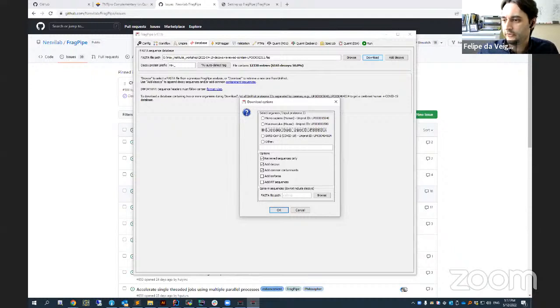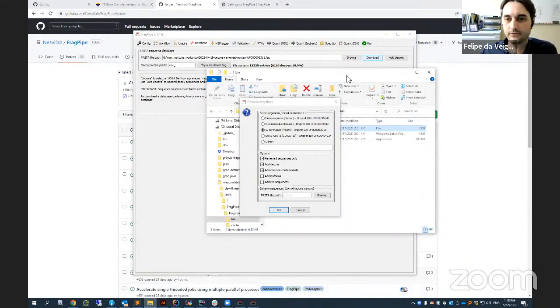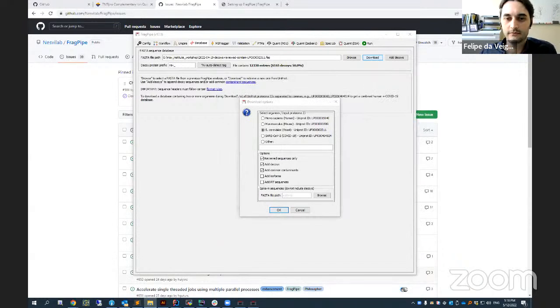FragPipe only shows TMT 16. Does it support 18? Yes, I think this version that we are showing right now doesn't have TMT 18 on the listing so far, but yeah, you can do the TMT 18 analysis.